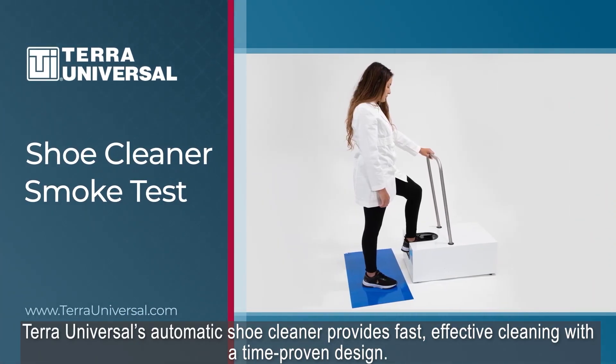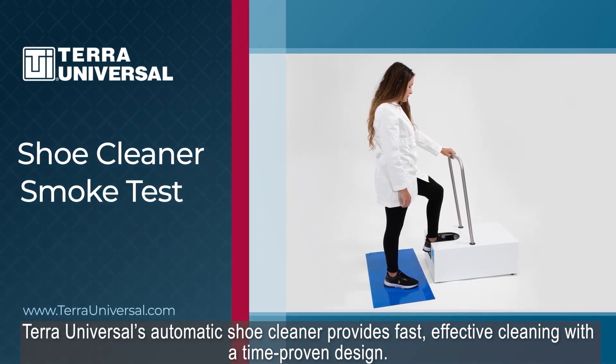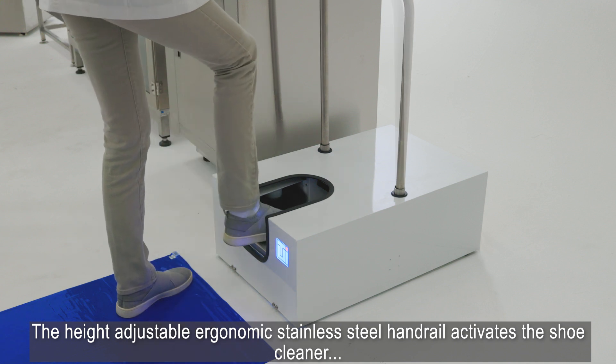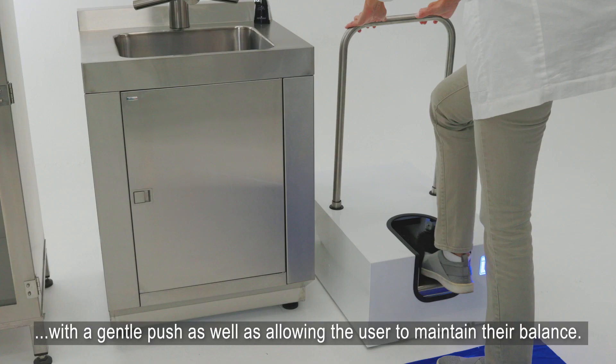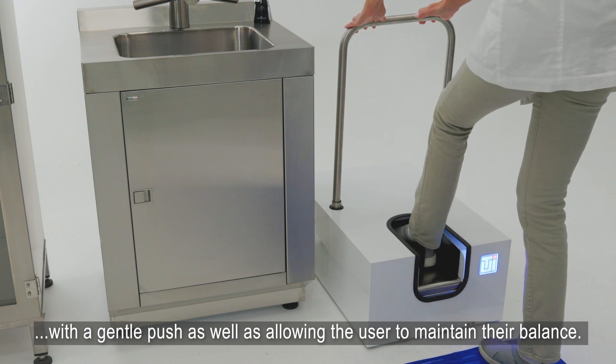Terra Universal's automatic shoe cleaner provides fast, effective cleaning with a time-proven design. The height-adjustable ergonomic stainless steel handrail activates the shoe cleaner with a gentle push, as well as allowing the user to maintain their balance.